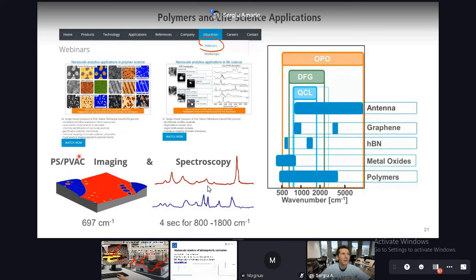And if you want to experience how fast a QCL can be tuned, I would recommend to watch our live demonstration, either the SNOM live demonstration or the tapping AFM-IR live demonstration. Hope that the question was answered. Otherwise, we can also discuss it in more detail after the webinar.